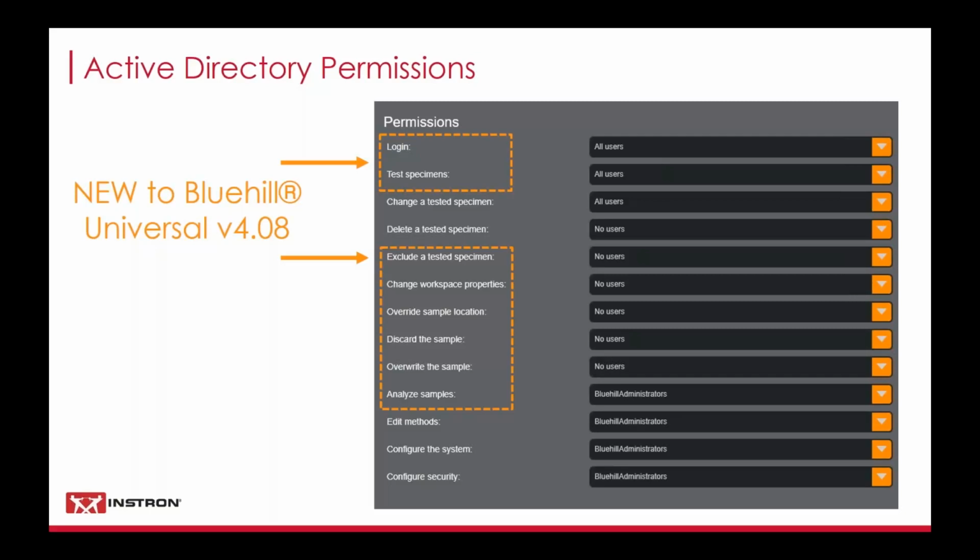And it would be very cumbersome for you to go into your historic data and add those same user calculations. So if that's the case, you would want to basically use this analyze module to replay your sample files, which could be very powerful, but maybe you would only want an administrator to have that ability because they understand the use case for it.